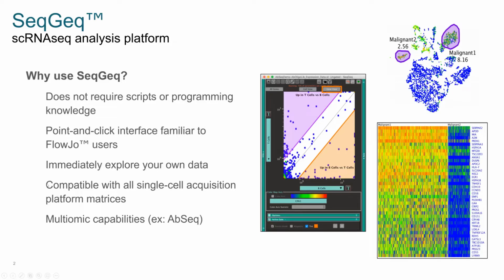It's compatible with various single-cell acquisition platform matrices, so it's not written with a particular instrument in mind.